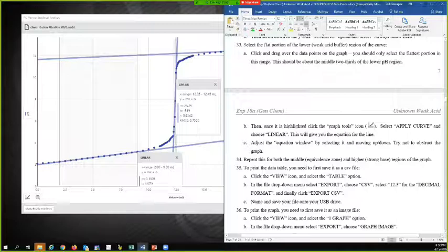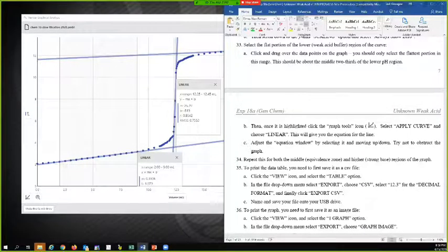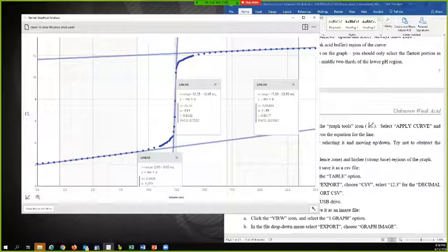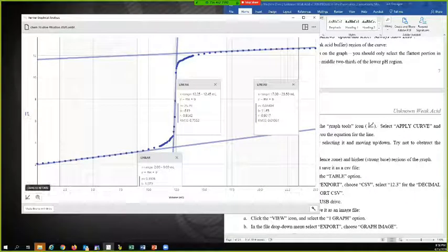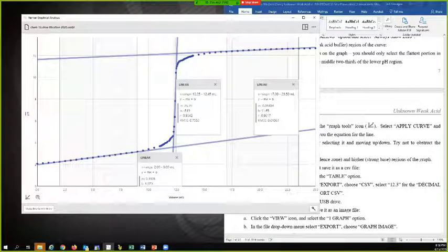To print the data table, you need to first save it as a CSV file. So go to view icon and select the table option. I'm going to go back over here and that's zoom. That's not what I want.